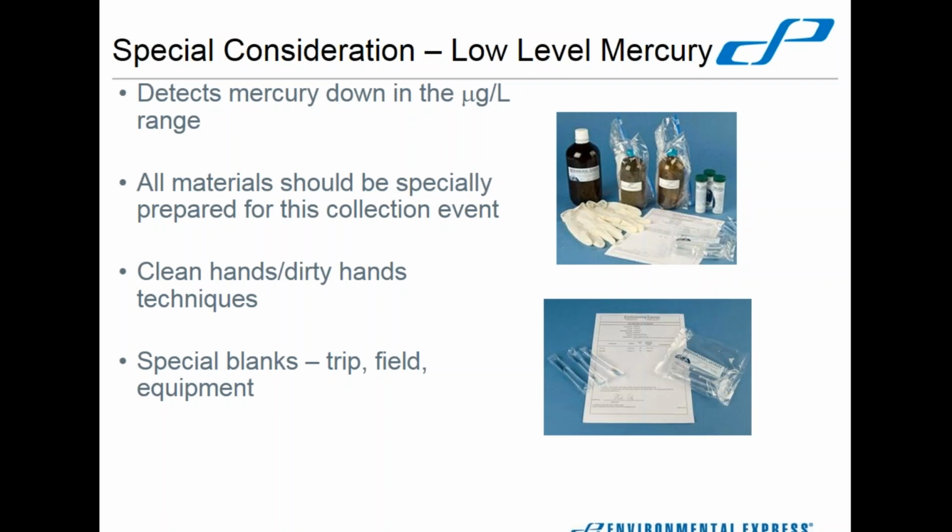Everything that's involved in low-level mercury sampling has to be specially done for that low-level mercury. The sample collection bottles, the gloves, the preservation supplies, usually you will need to transport special water just for the event. Everything needs to be kept meticulously clean for your low-level mercury sampling.